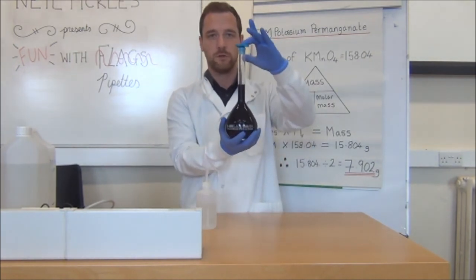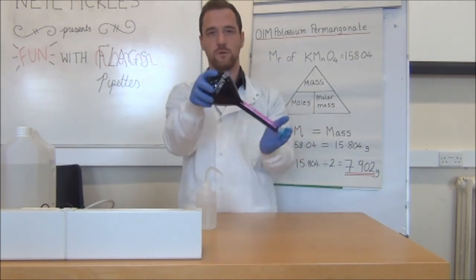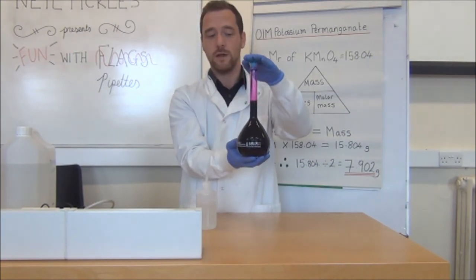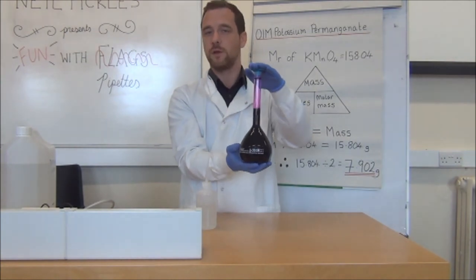It's always a good idea to put a stopper on and to invert a couple of times to ensure a homogeneous solution. And that is your solution ready. And then of course you would label this volumetric flask and store it in the appropriate way.